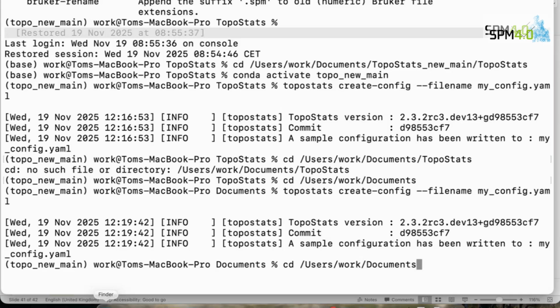So have we loaded anything in? Units? No, we don't need any units. But that's just plus 0. Okay, so just like the images. It's exactly the same as what we did earlier. Some stats. Right, find it.